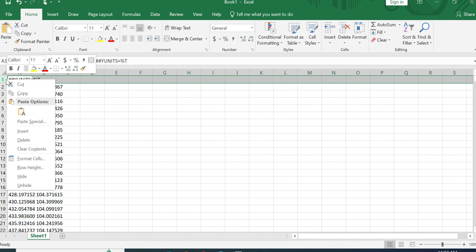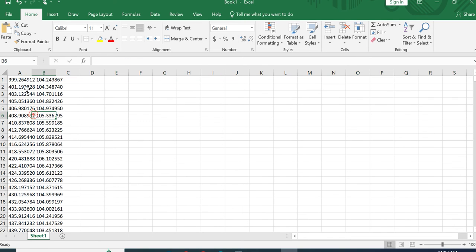So we will right click and then delete this row. Okay, so if I need to plot FTIR spectra from here, you can see it appears as one column, so I need to separate this column into two columns. For example, if I press on this, this value appears as one value, and there is a space after digit 2 here, so I need to remove this space.